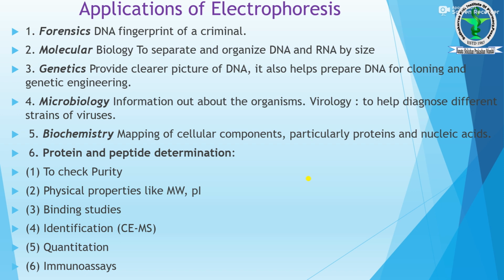Molecular biology: to separate and organize DNA, RNA by size. So molecular biology के अंदर भी हम separate and organize DNA and RNA. In the case of genetics, we get clear pictures of the DNA, which helps to prepare DNA for cloning and genetic engineering. There are special chapters like genetic engineering, gene cloning, and so many. These are the biotechnology parts.